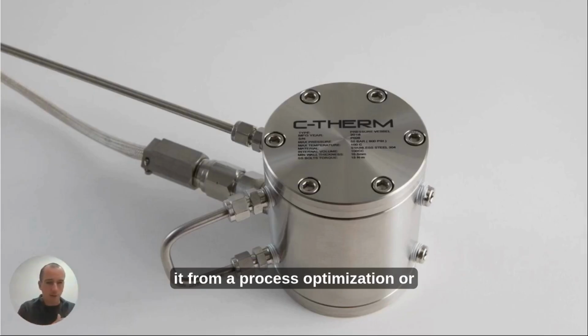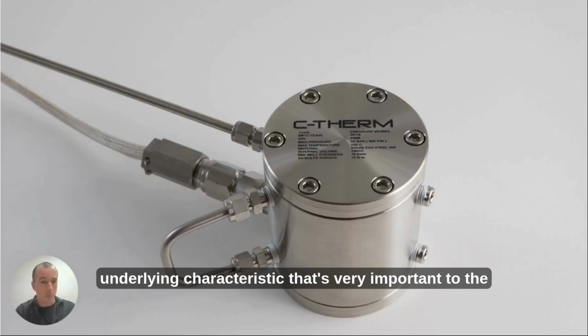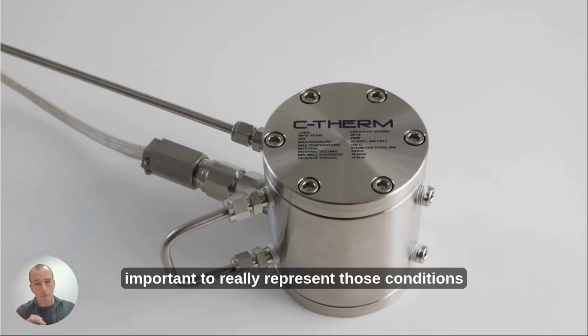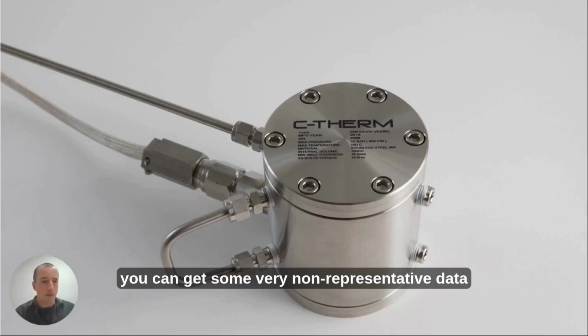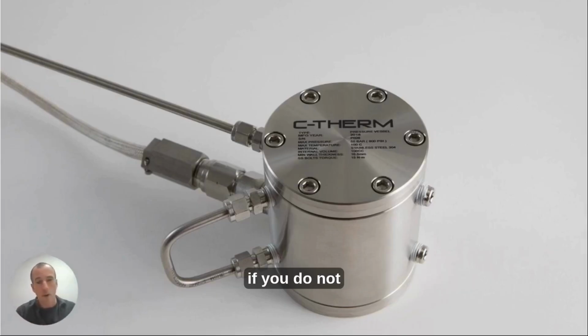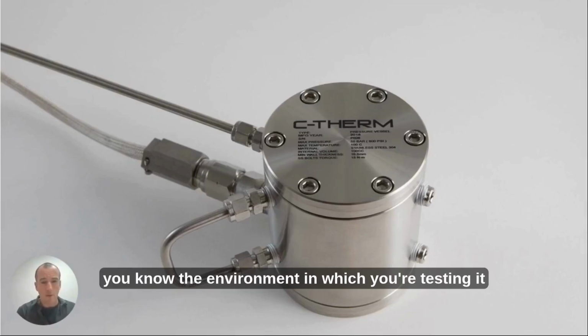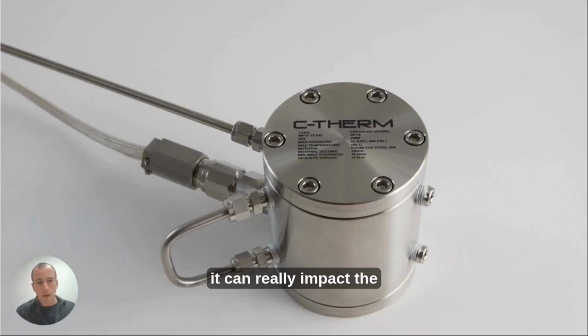Often we're trying to model it from a process optimization or process safety perspective, or it's an underlying characteristic that's very important to the ultimate performance of the material. So important to really represent those conditions in the testing of the material. You can get some very non-representative data if you do not pay close attention to some of the environmental considerations, how the sample is oriented, the environment in which you're testing it. If you don't watch those things carefully, it can really impact the quality of your data.